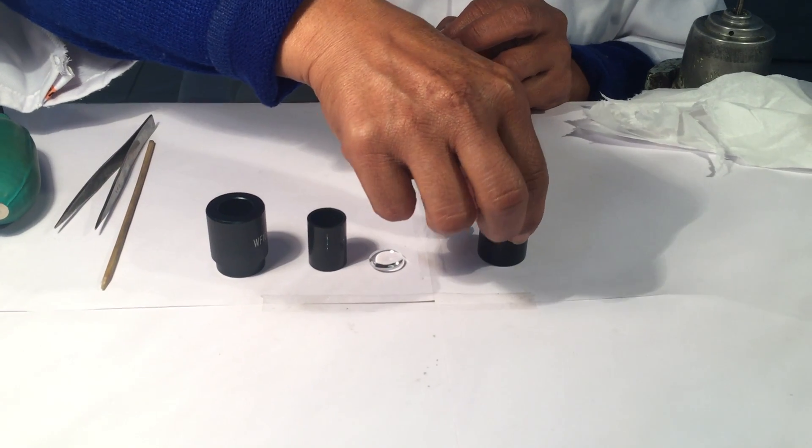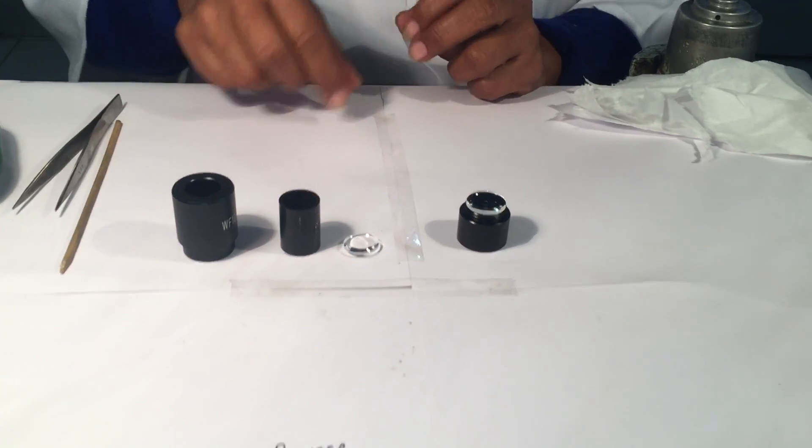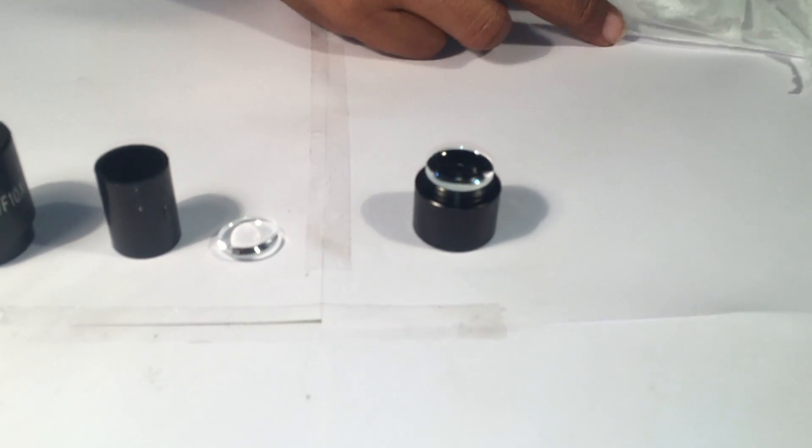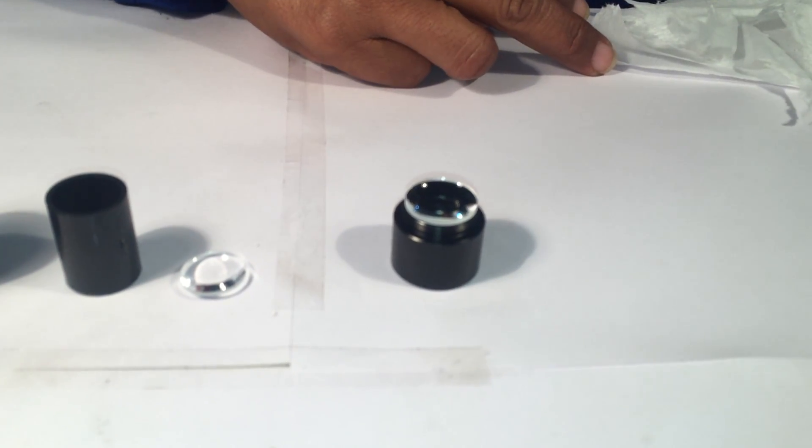The flat surface of the field lens should be on the upper side placed on the lower.